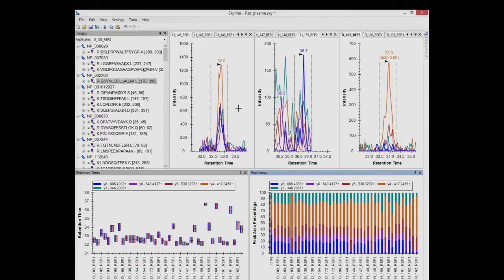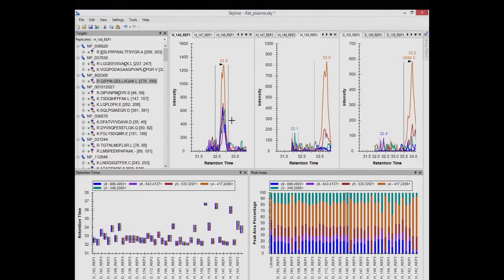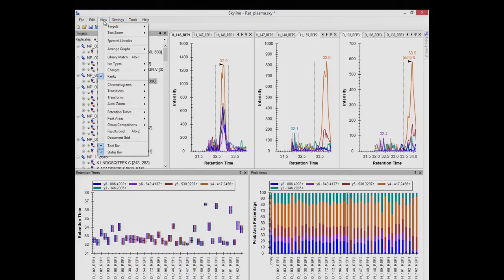So I showed you synchronized zooming. Here again, you could click and then move your mouse wheel to see some synchronized zooming. We could also go to view, and actually maybe some of you are already in this. I don't know. If you were not seeing the peaks close up, was everybody seeing the peaks close up?